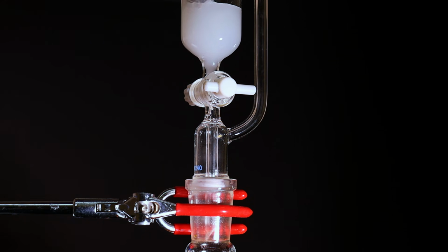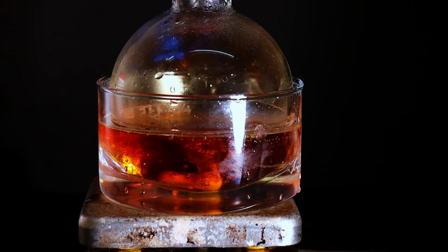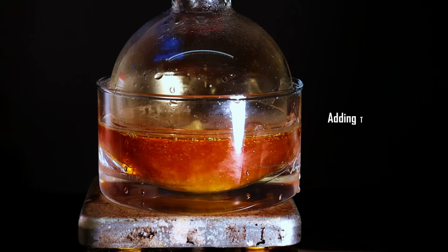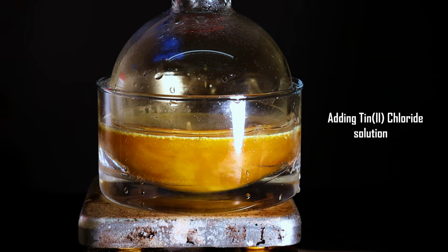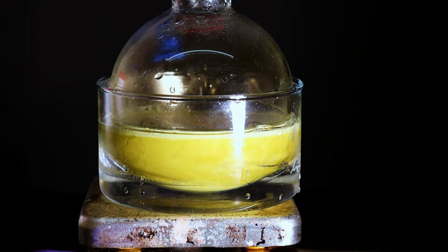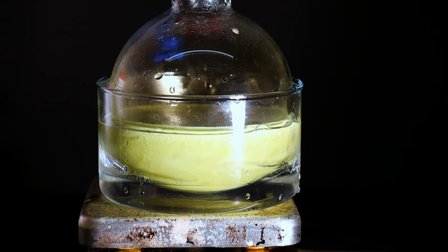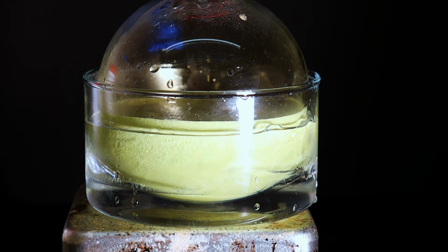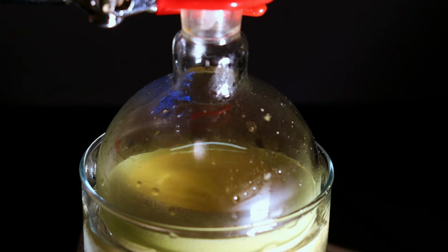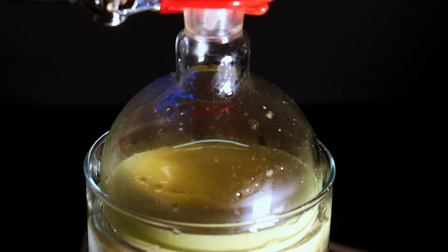Now all I have to do is to once again very slowly add all of the tin solution to the flask while keeping everything ice cold. Like before, you can see that immediately a white precipitate forms, and that is actually our desired end product, phenylhydrazine hydrochloride. As more and more tin solution was added in, more and more precipitate formed, and eventually it got so thick that it was barely stirring.